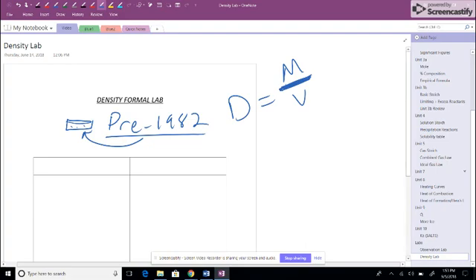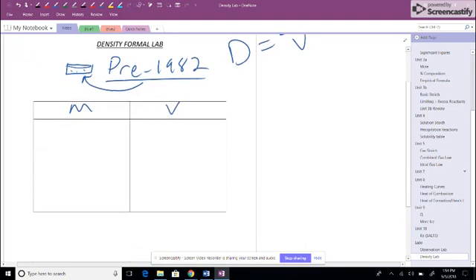So let's say we had these pennies and we wanted to know what metal they're probably made of. Again, we have to use the word probably because we might have some error involved in this lab. So let's go ahead and find the mass and volume of 25 pennies. The benefit of doing 25 pennies is that when we go to find the volume in a graduated cylinder, and you're wondering again, why is the graduated cylinder so wobbly? I don't know, it just is. You can see the volume change a little bit more easily with 25 pennies than with 1 penny.